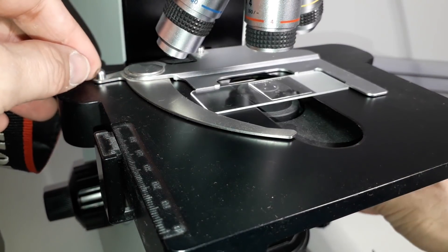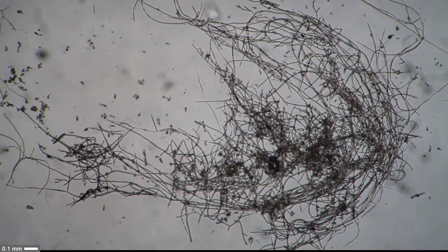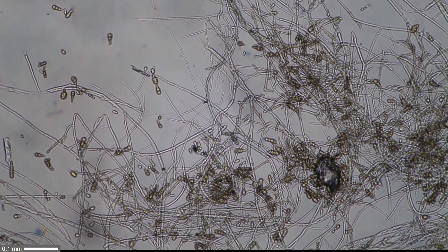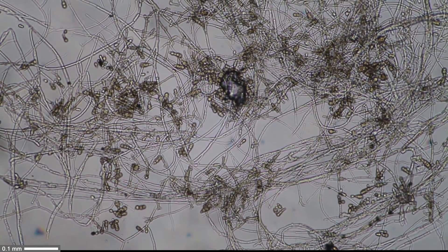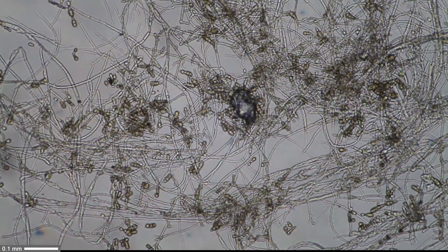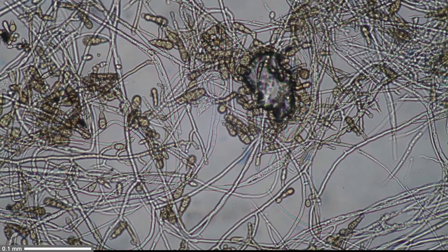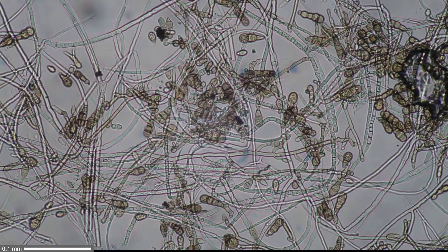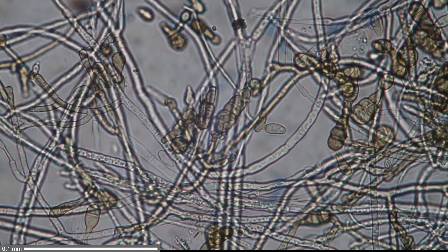A first rough visual inspection under low power does indeed show that there is a fungus present. Those string-like structures — that's the mycelium. At higher magnification we can already start to see more details. Those round oval structures are the so-called conidia of the fungus; they produce the spores, which are not healthy — especially if inhaled, they can cause allergies and other problems. At 10x and 20x objectives, the conidia become more visible, and their structure and shape can already give a hint about what the fungus could be.